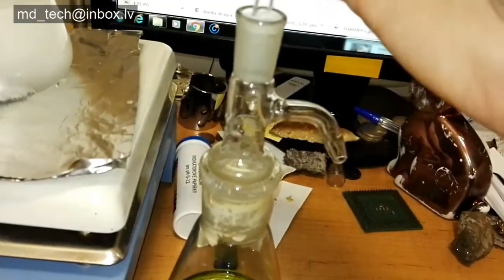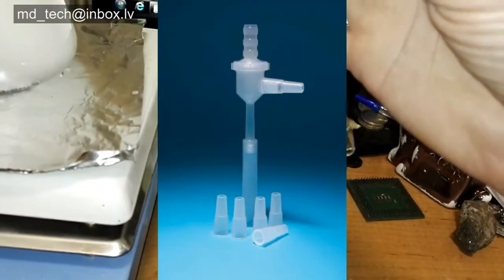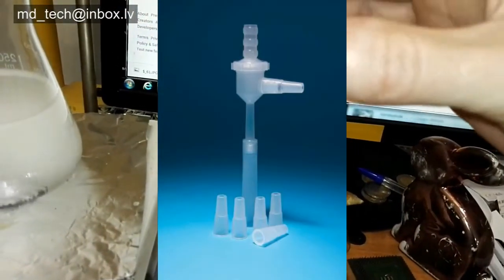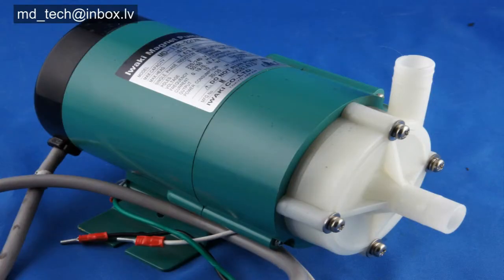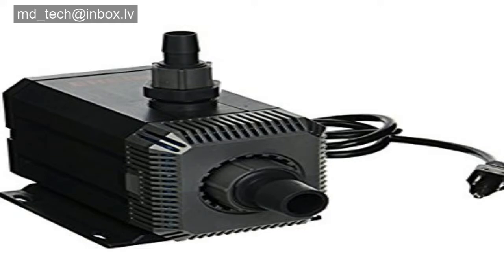Today I show how I made my gas scrubber system. It is very simple and uses cheap materials. First you need a plastic vacuum aspirator and any plastic water pump. I use a Fuji photo lab chemical pump, but if you want to use aquarium pumps, that's a very good choice.